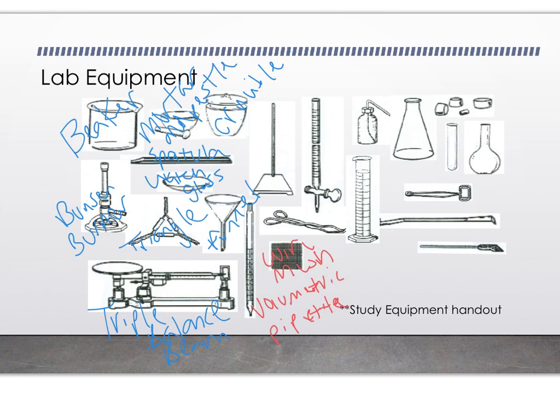Then we go up to your tongs here. This one is specifically known as crucible tongs because it can move a crucible from one location to another. There's also beaker tongs out there and also test tube tongs. So this test tube tong will be used to transfer the test tube from one location to another. So just be aware of the 3 different types of tongs, but they are used to transfer different pieces of equipment from one location to the next.